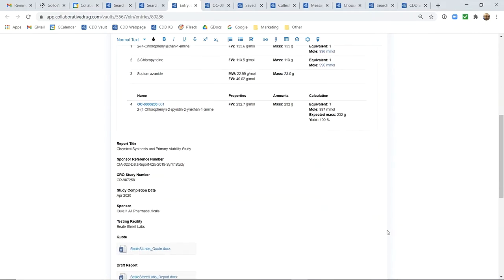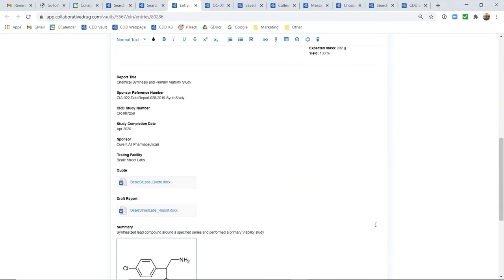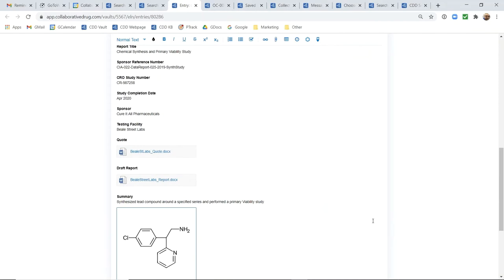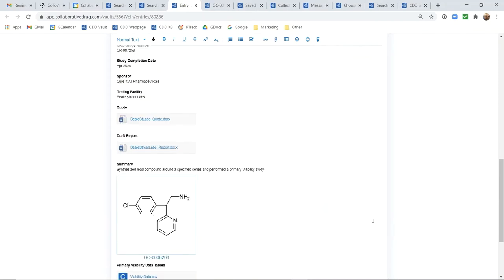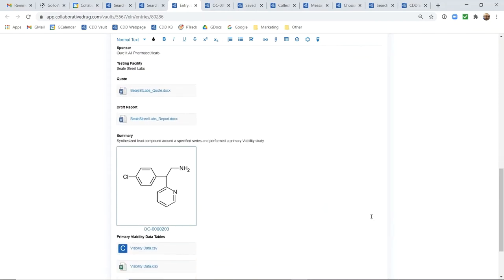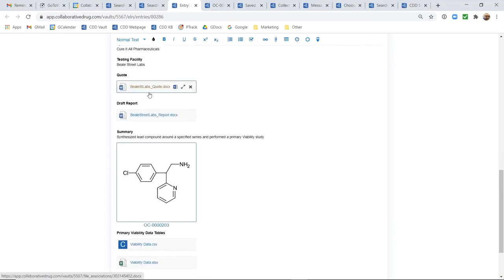As I scroll down through this ELN canvas, you'll notice all of the different places are documented here. We have a Word file that is dropped in, we do offer and provide a full integration with Microsoft Office.